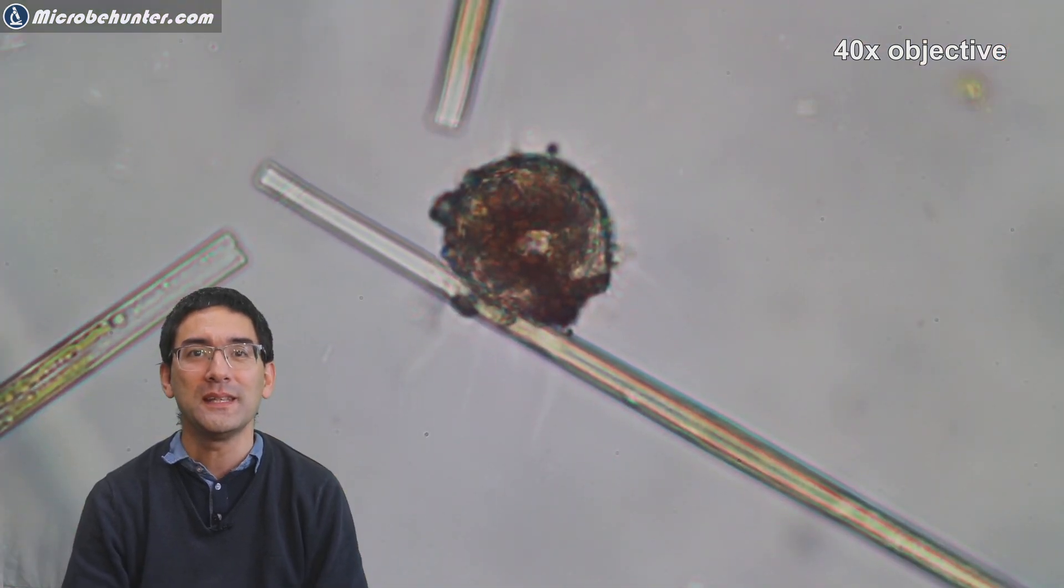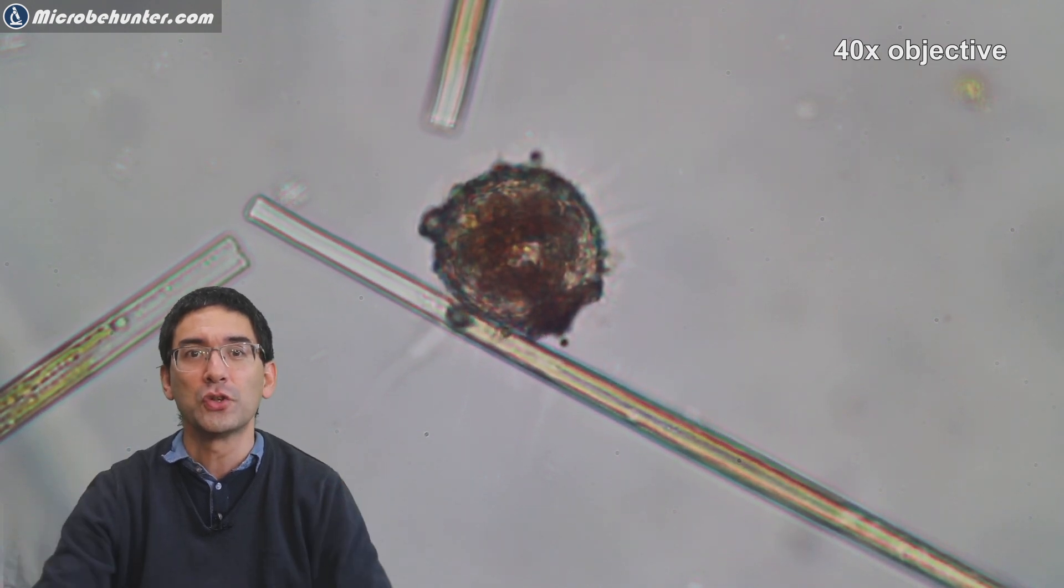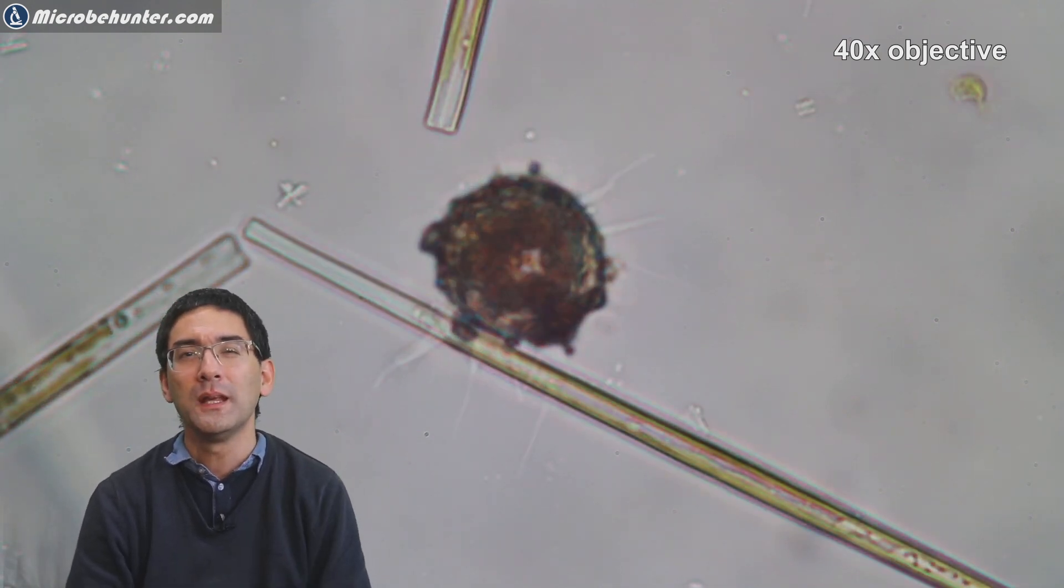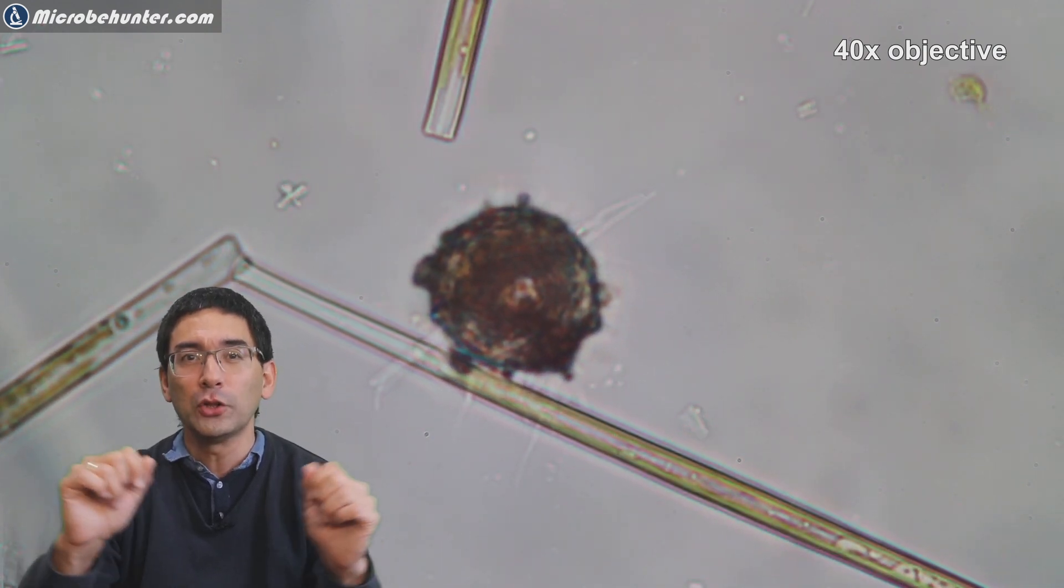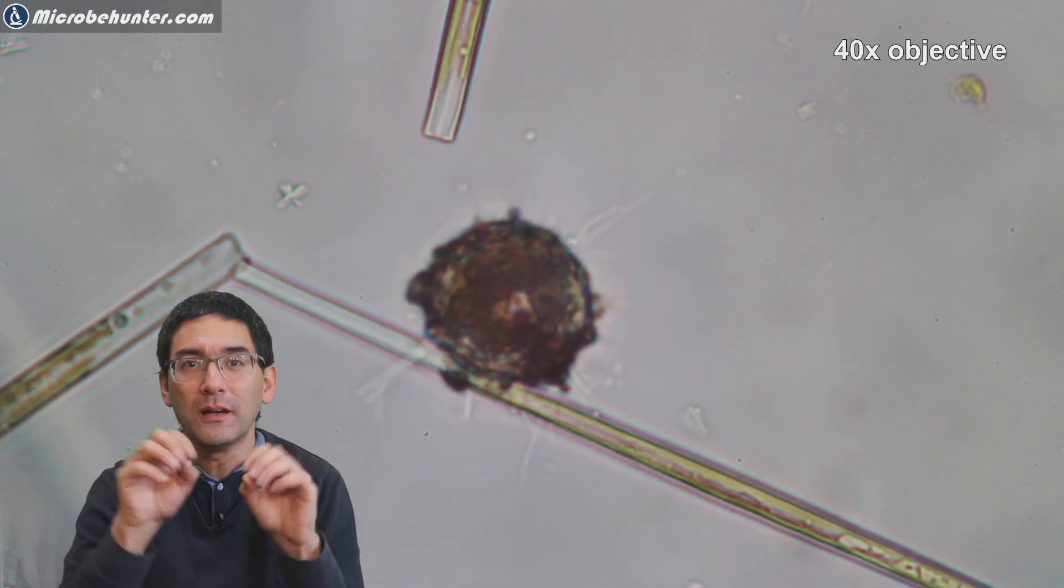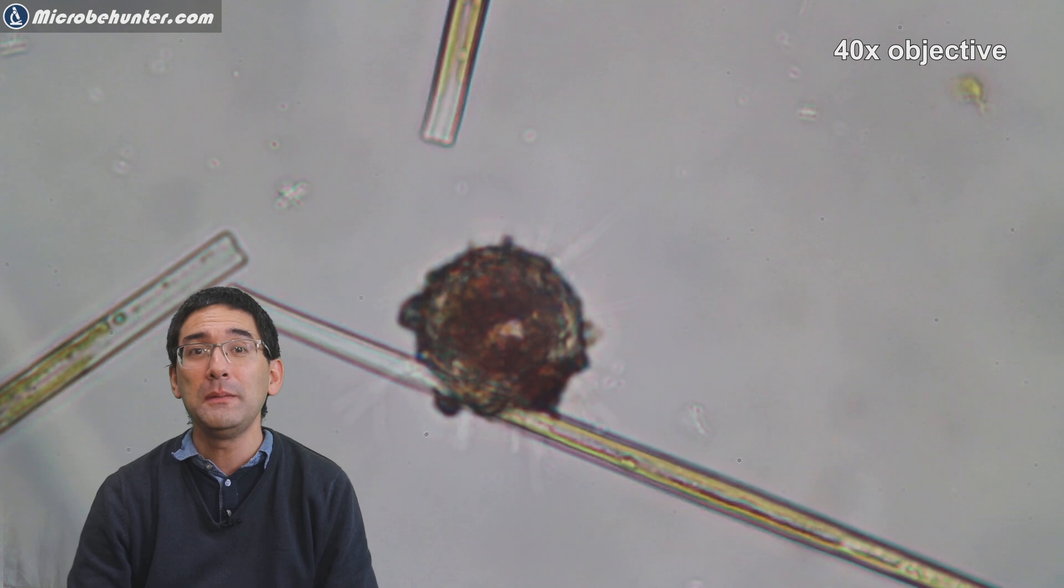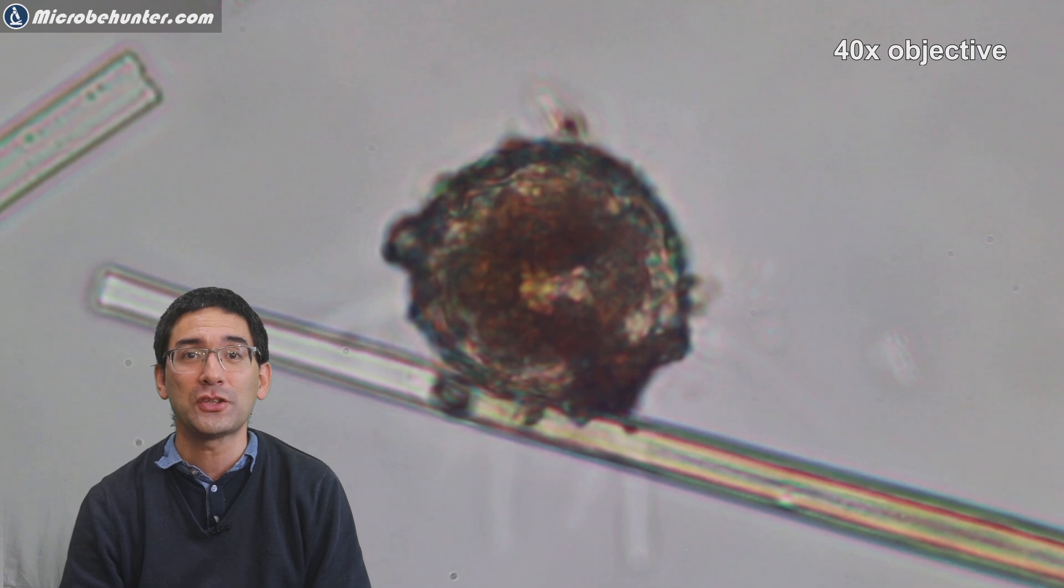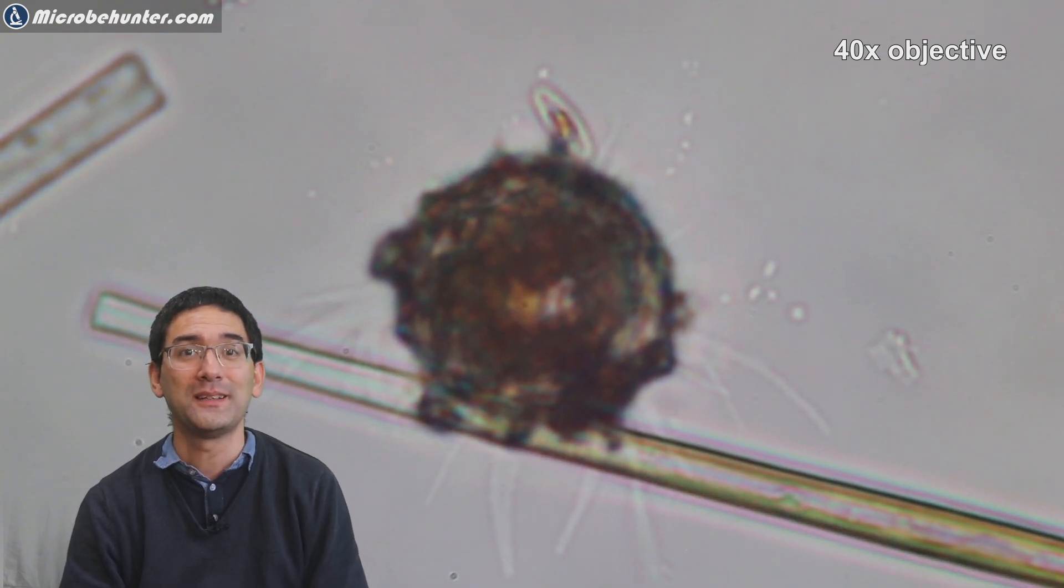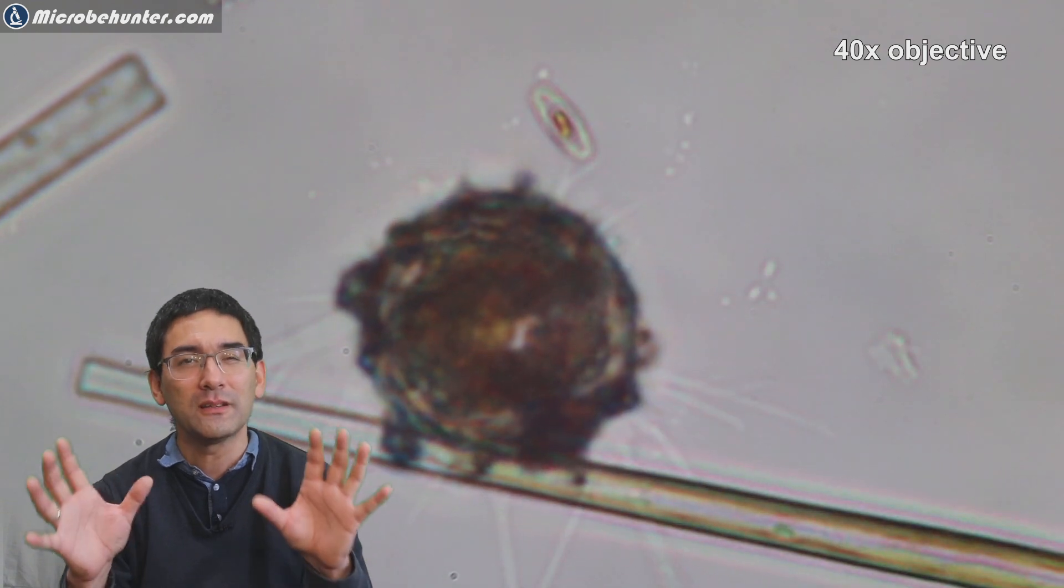This here, that's an interesting one. That seems to be a test state amoeba. The tests are the so-called shells of certain amoeba. If you look carefully, you can actually see also those pseudopodia, these are the cytoplasm extensions that stretch out of this central shell. The amoeba uses that to catch food and also to move around. This is not in time lapse, this is in real time right now, and you can see very slightly those pseudopodia, those extensions of the cytoplasm.